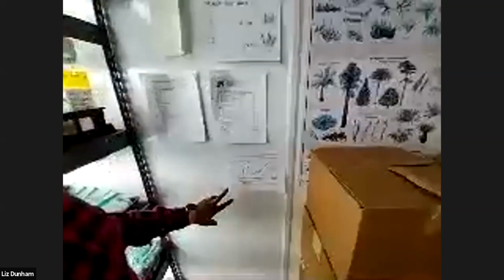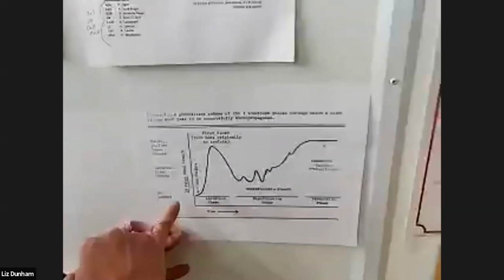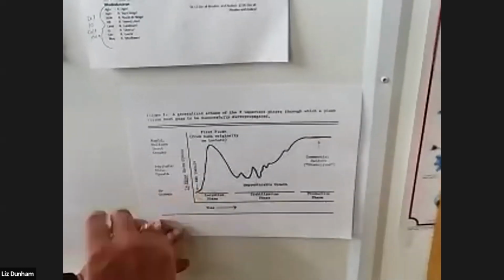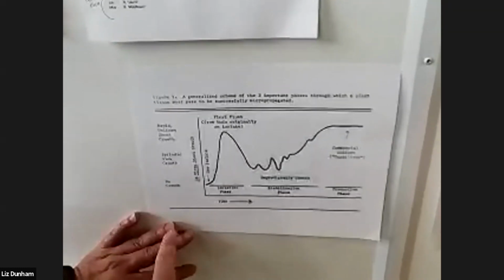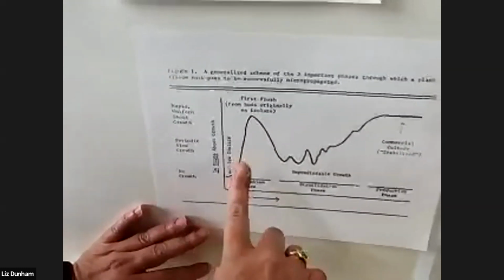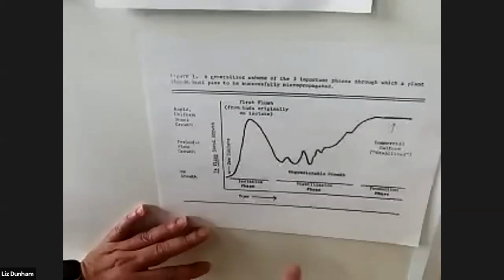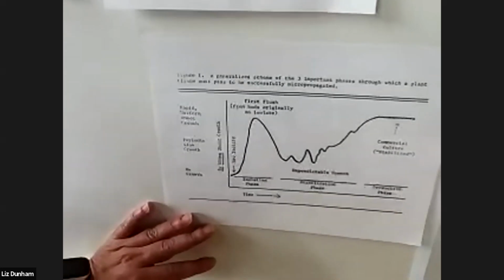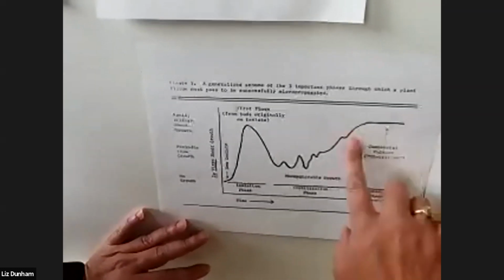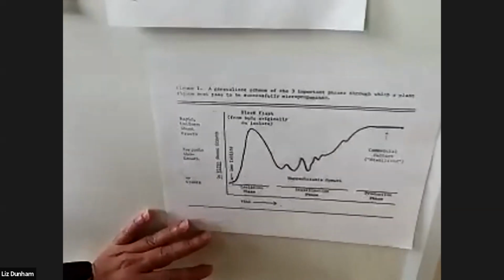So right here, we have the process of tissue culture. When we get a plant in, and they'll go into our greenhouse normally, we'll get a potted plant, it'll flush new growth. We'll take cuttings from that and we'll put it into what we call isolation. So we're gonna clean it and then put it into culture. And what it's gonna do is it's gonna flush new growth. It's already got energy from the plant that was in the pot. And then it's gonna sort of sit in culture and we're gonna turn it over a couple times, maybe put it on new media, and it's gonna have this funny growth and decide if and when it wants to grow in culture. And then eventually we're gonna get a steady growth, something with a multiplication rate that we can count on to fill the orders, and then it's in commercial production.